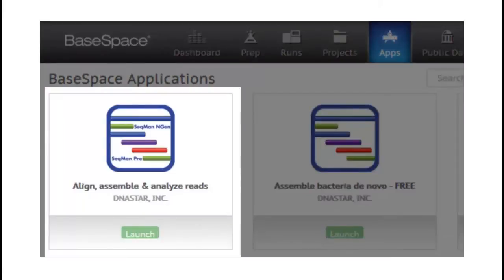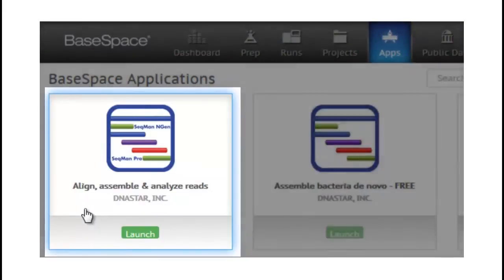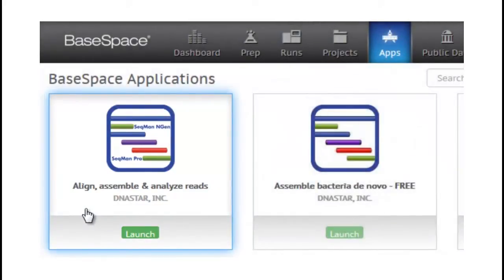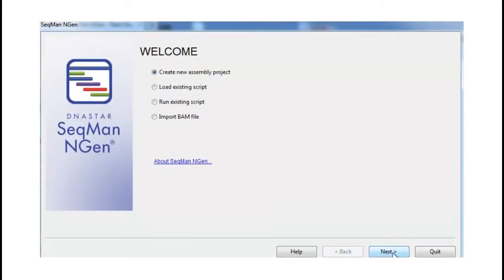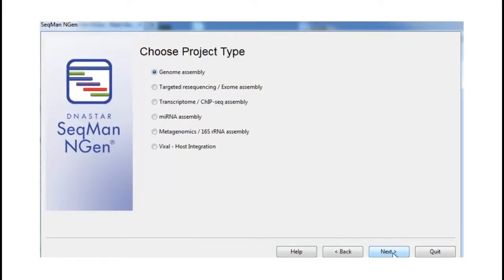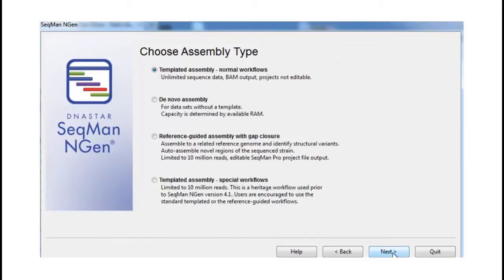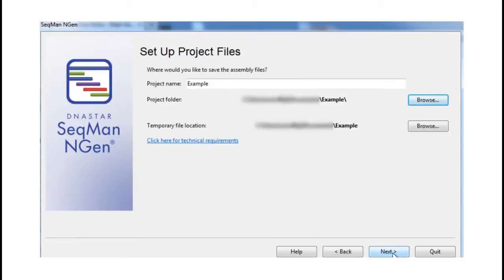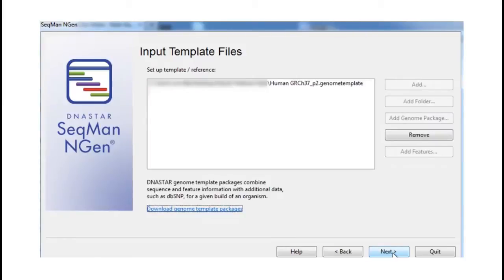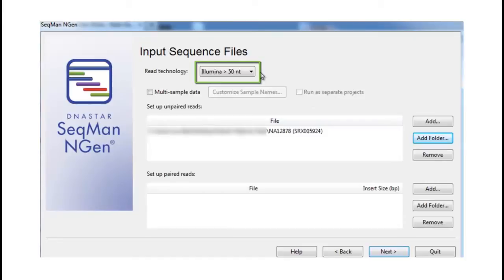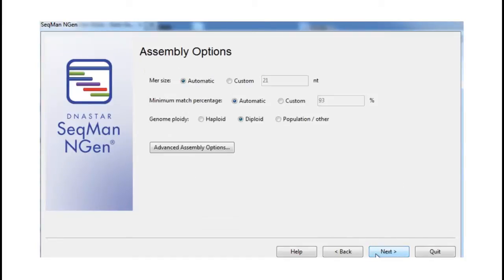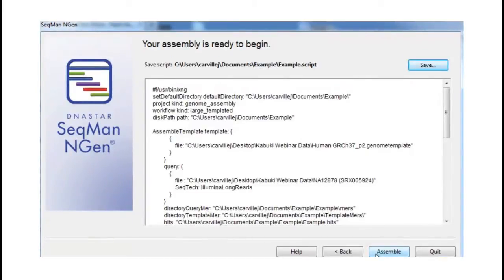Our second BaseSpace application allows for the use of both our SeekMan Engine and SeekMan Pro programs. We do have a free trial version available for this application. Our SeekMan Engine application supports a wide variety of next-gen sequence assembly projects, as well as both templated and de novo assembly options. Like in our previous application, setup is an easy step-by-step process in our wizard, leading you through the import of your Illumina data. SeekMan Engine has many customization options available. After completing the wizard, you have created a script that, after assembled, will result in a BAM file fully integrated with the rest of our DNA Star applications.